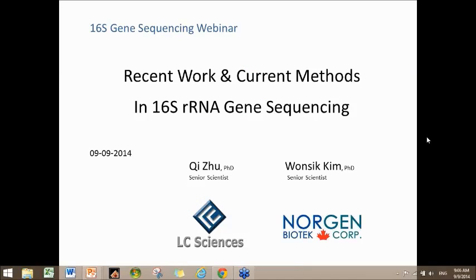Good morning, everyone. So welcome to our webinar. Today, our topic will be on the 16S gene sequencing, and this is the application of next generation sequencing.